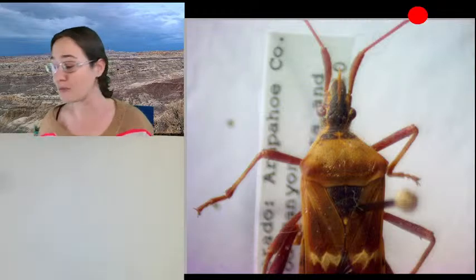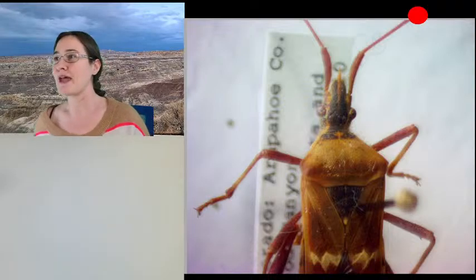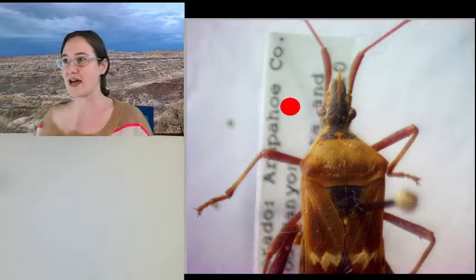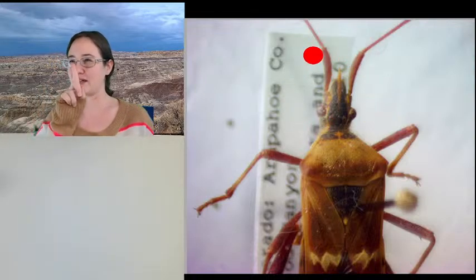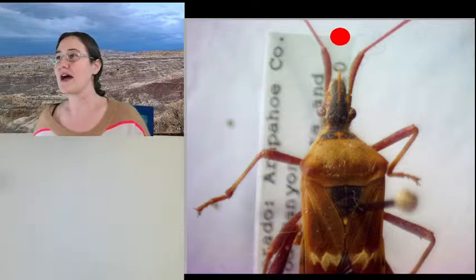Because this is a true bug, he has a piercing and sucking mouth part, and something that identifies the species is this, the jugum and tylus. I think the tylus is the one in the center. It has this, like, spiked tylus.